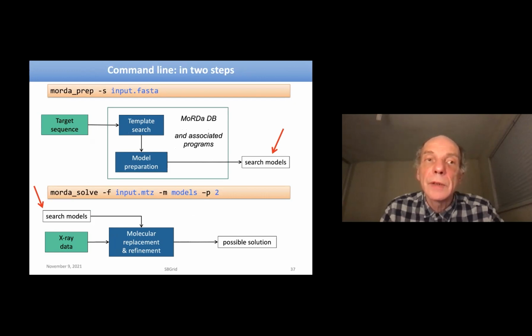First, generate models, maybe manipulate them, or remove those you don't like, or add more models based on what has been already generated automatically, and continue to the molecular replacement solution as such.